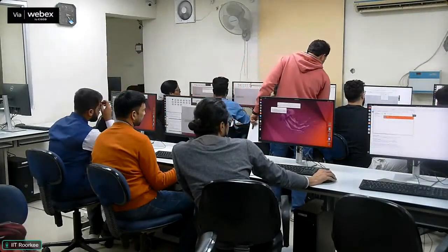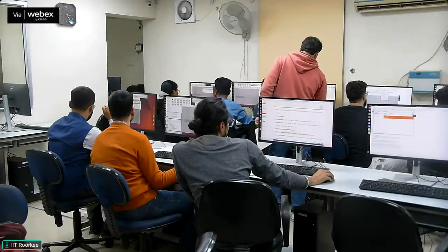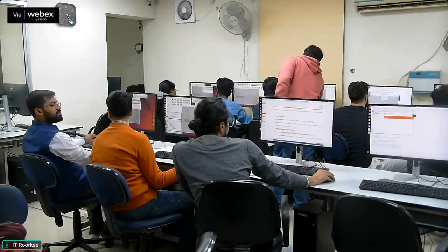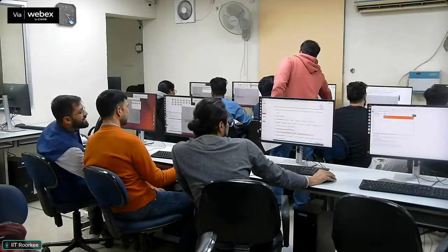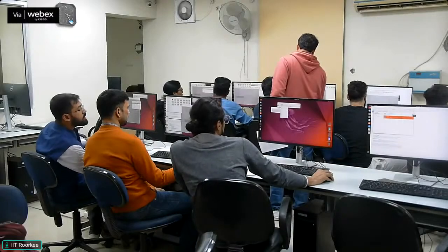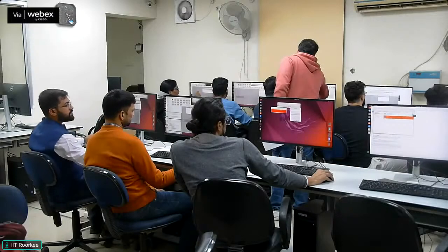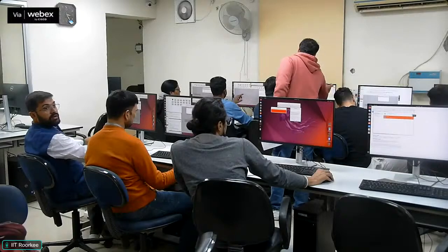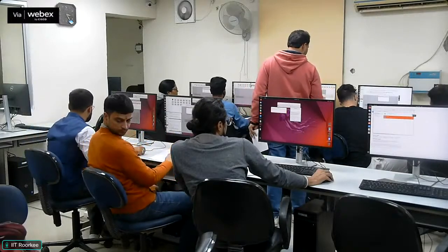Actually, the length of every slug is different. That's why we are finding the average slug length. In that case, that is one slug. Then select the second image only when that slug has passed that line. So you do not need to select the same image every time. You can select the second image, then the third one. In the fourth one, both slugs are coming together. So in 3-4 images, you can find out the average slug length.